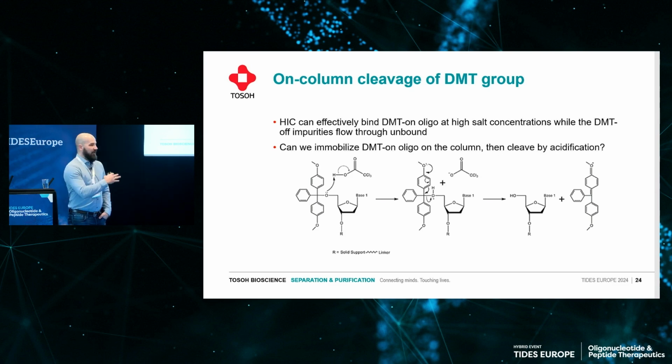And something that I have presented already 3 years ago is that using HIC, we can effectively bind a DMT on oligo to the column, and then by decreasing the salt concentration, we can elute that DMT on oligo from the column.